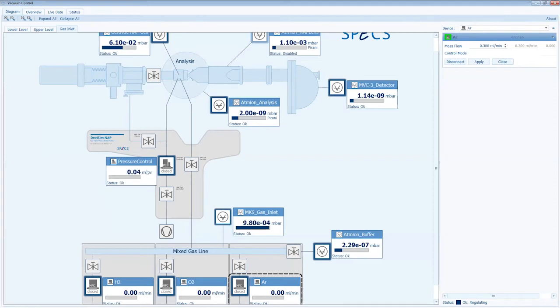If you open the pressure controller, most of the gas you are actually evacuating, and of course we have to increase the flow rate in order to keep the pressure inside the cell at the desired value, like for example 1 millibar. If I put here 0.3 milliliters per minute, the minimum value that those flow controllers allow us to set, it doesn't allow us 0.2. So we have a bypass if we want lower pressure. That was one of the ideas of Professor Ernst Bauer I mentioned during my talk.